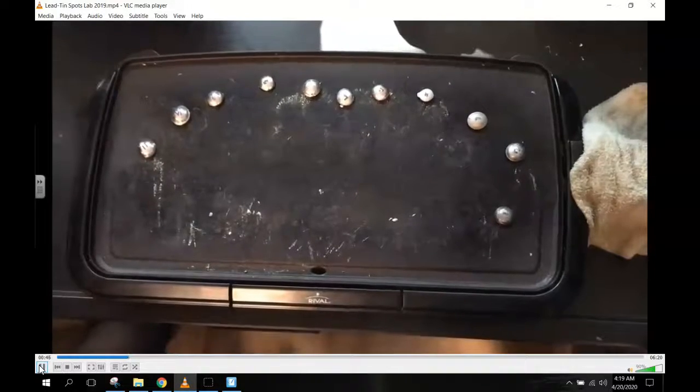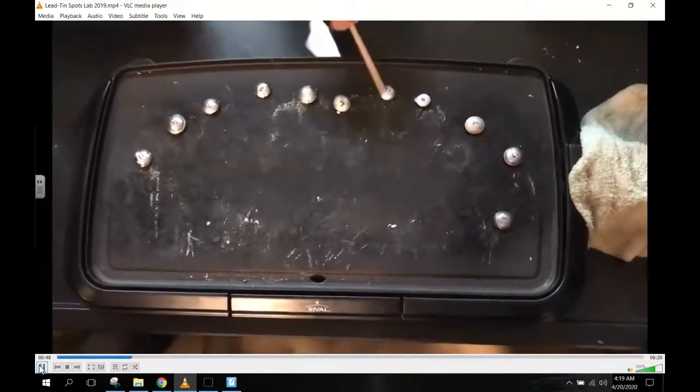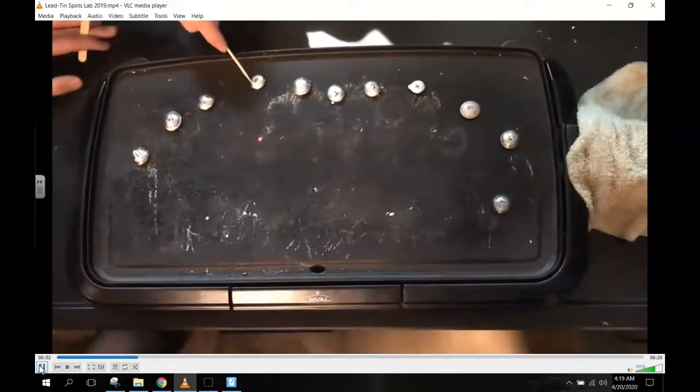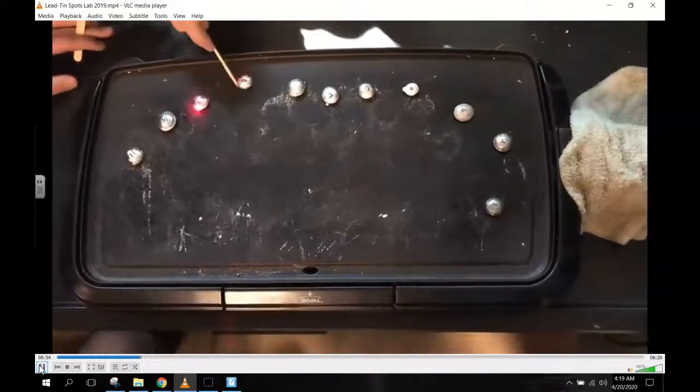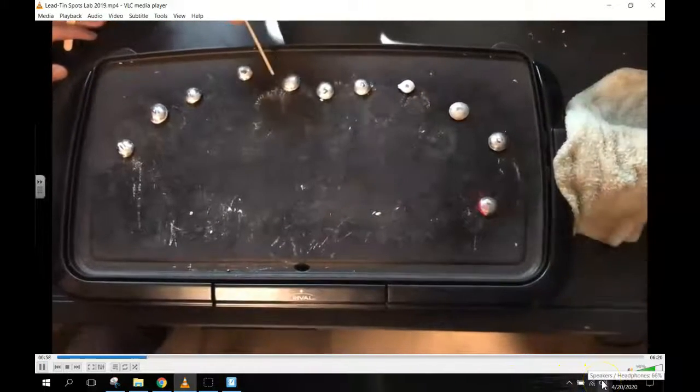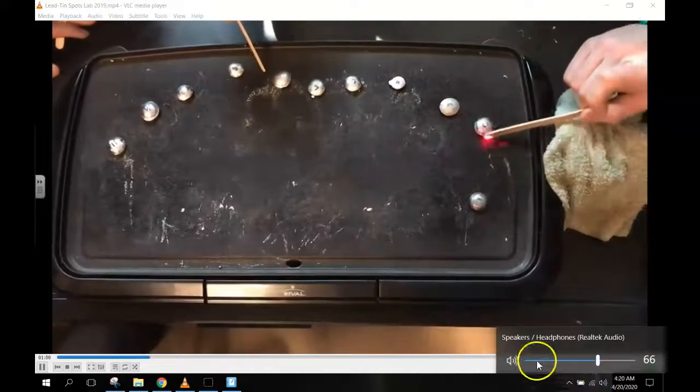295 degrees. Oh my god. Oh, we're like halfway there. Put your laser pointer on the hot plate, see how fast that melts. Wait, which one's the... Really? Put your tongue on it. How hot's this one? I'll put my tongue on it for 50.